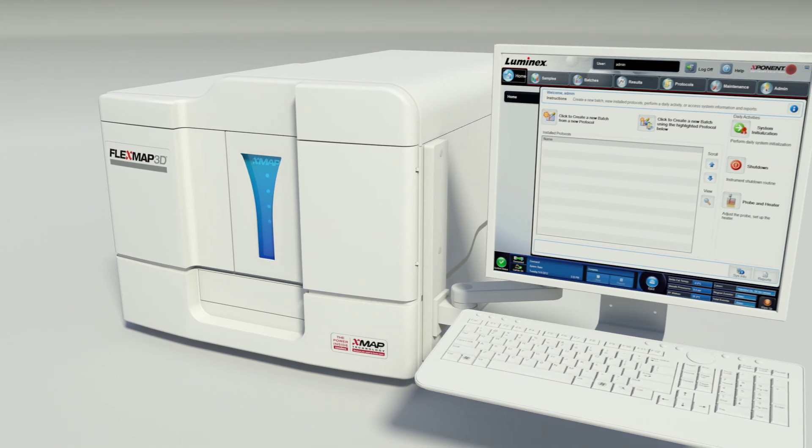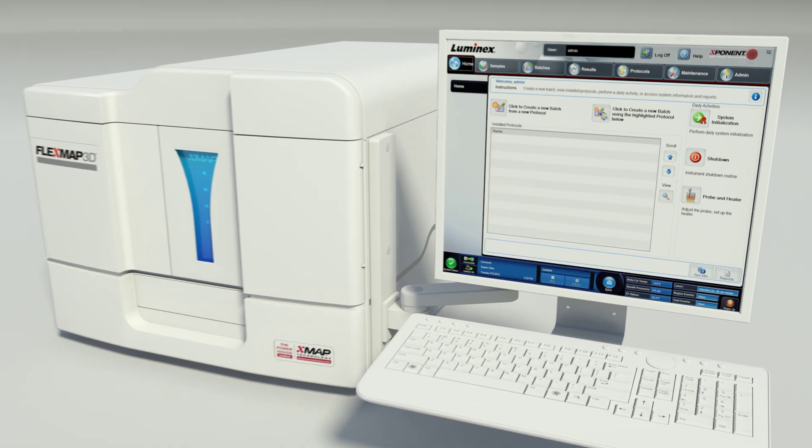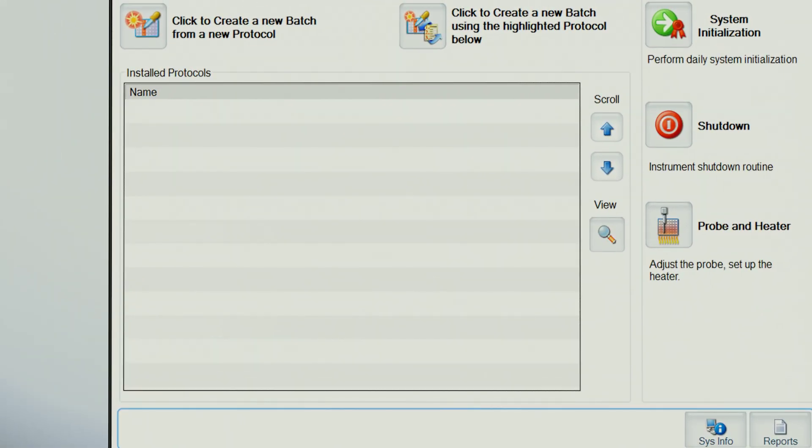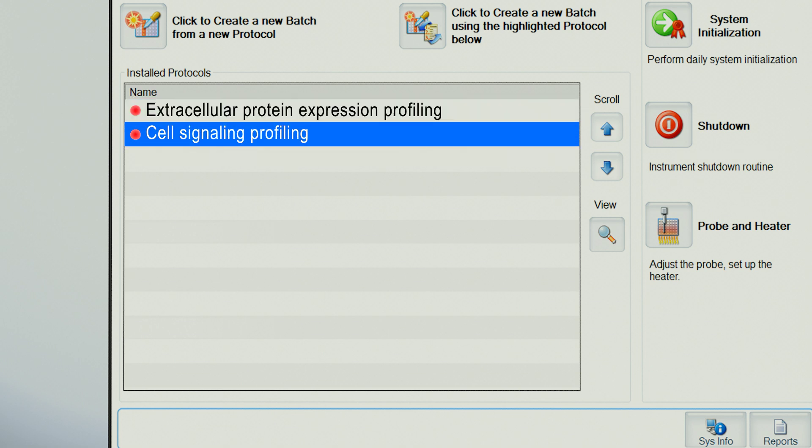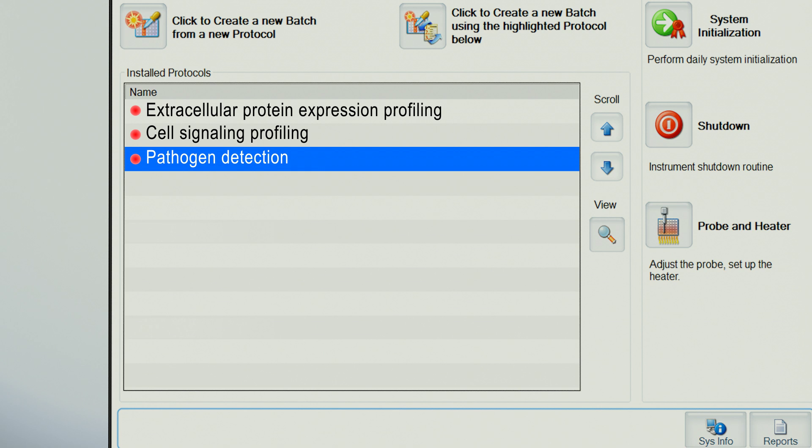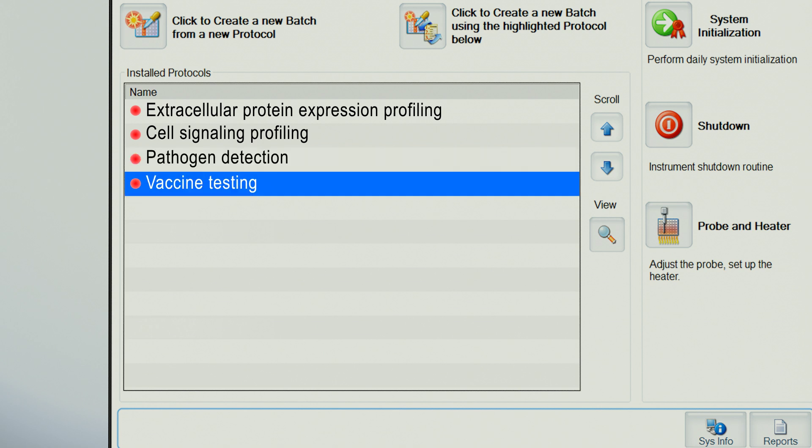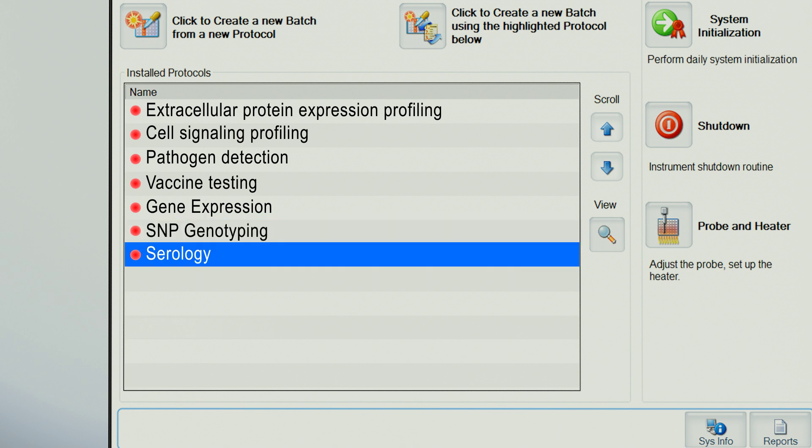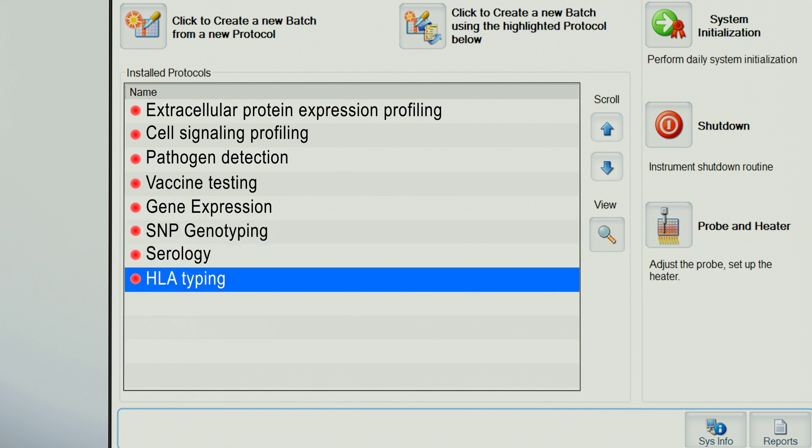The FlexMap 3D is used in a wide variety of applications including extracellular protein expression profiling, cell signaling profiling, pathogen detection, vaccine testing, gene expression, SNP genotyping, serology, and HLA typing.